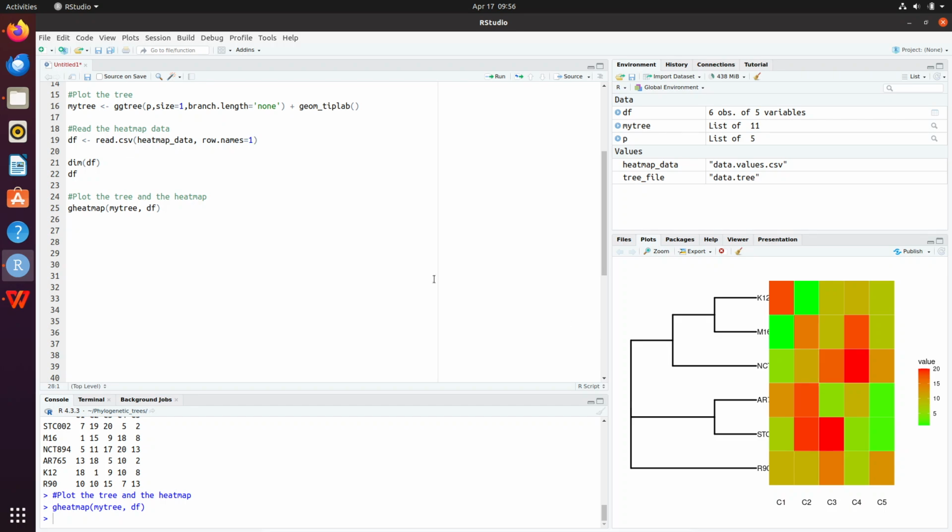So there's a way to correct this. In the next step, what we are going to do is to increase the space between the tree labels and the heatmap. Okay, so to do that, we still use heatmap. Specify the inputs, the mandatory ones, comma, and then we add what you call offsets. I'll say offsets equals. You can modify it as you see fit. Let's try with 1.